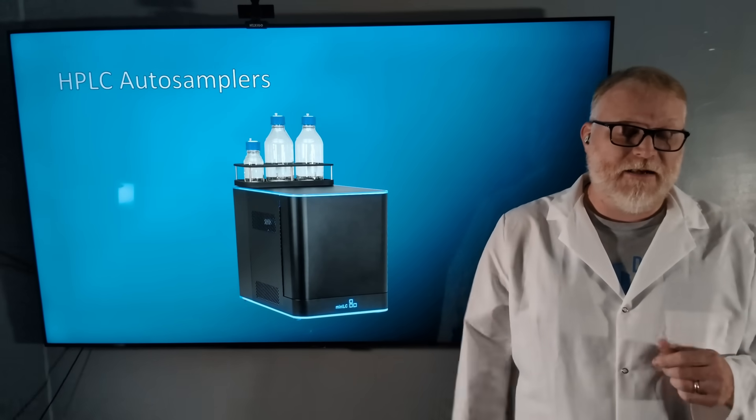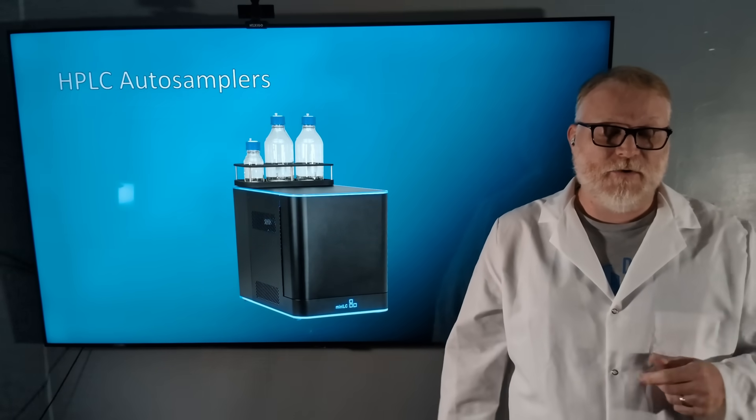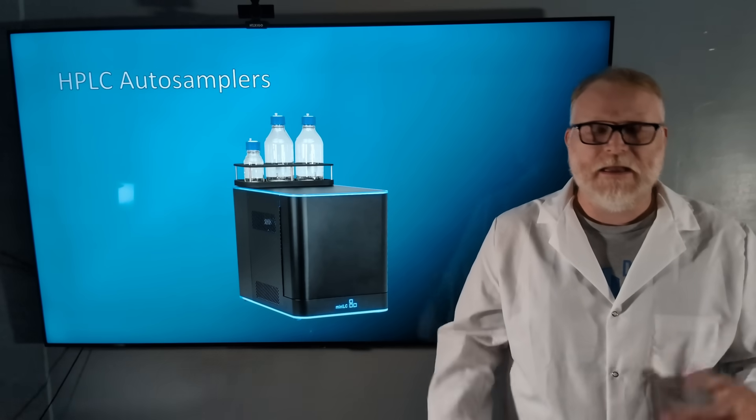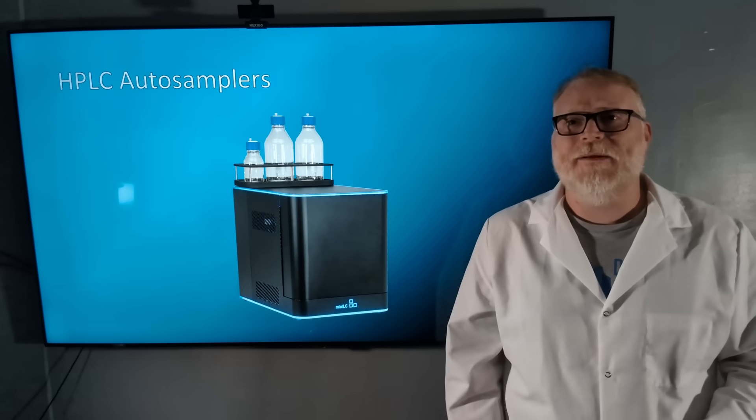HPLC autosamplers allow an analyst to inject multiple samples over the course of a batch without having to physically do the injection themselves. How do these autosamplers work? Well, let's find out.